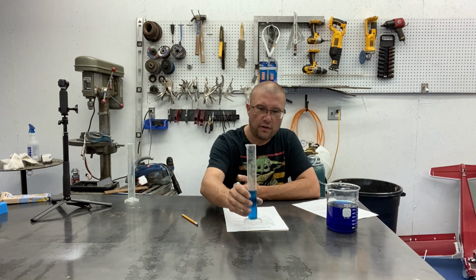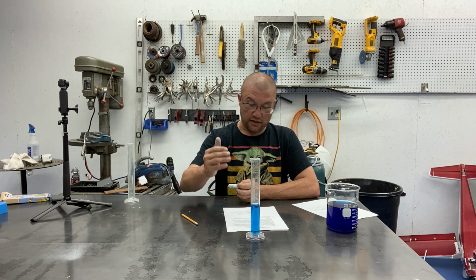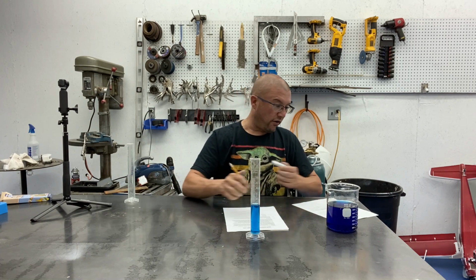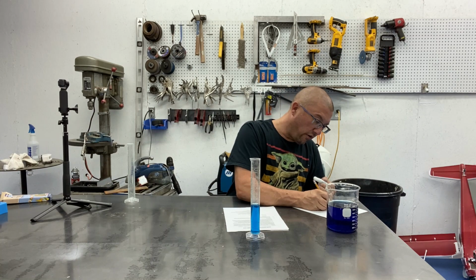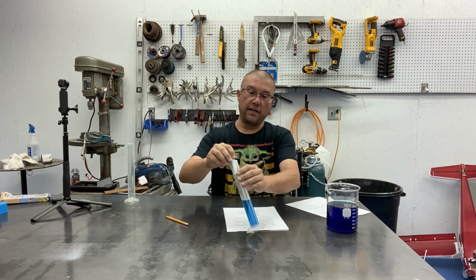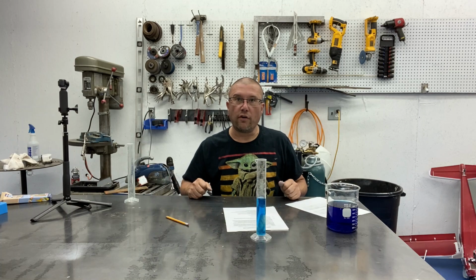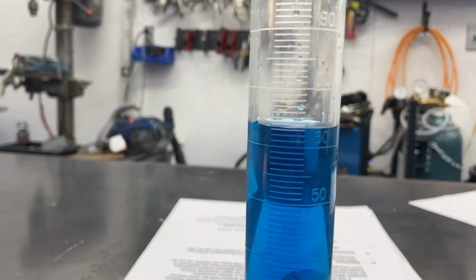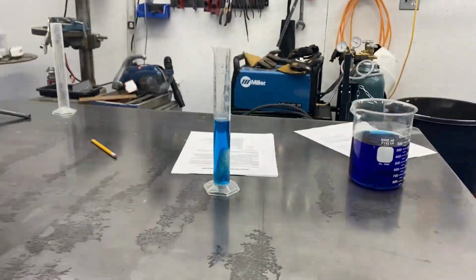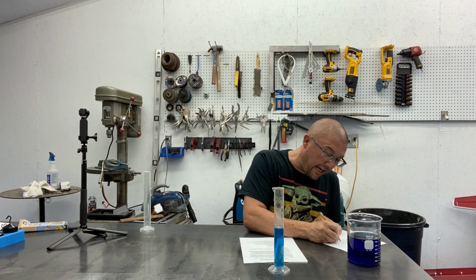I pre-filled this graduated cylinder with exactly 50 milliliters of water. So we're just going to do the same thing. We're going to record that volume in trial 2, volume of water, 50 milliliters, because that's what we use. We're going to lower it down into here. We are going to measure our second volume. So our value for trial number 2, volume of clay and water, is the same as the first trial, 63 milliliters.